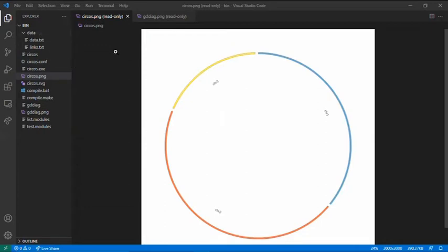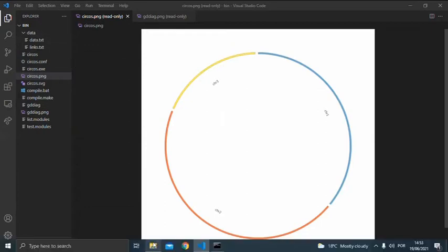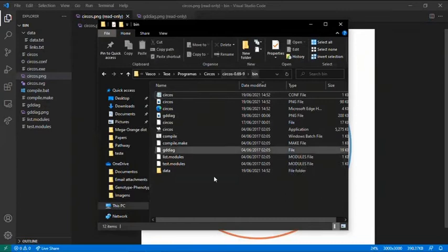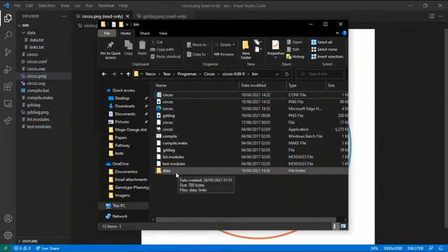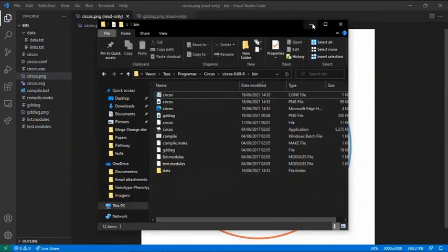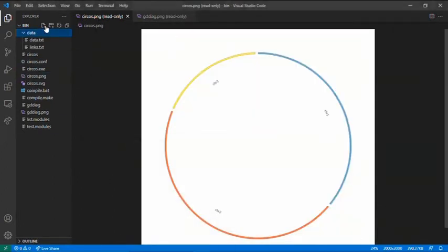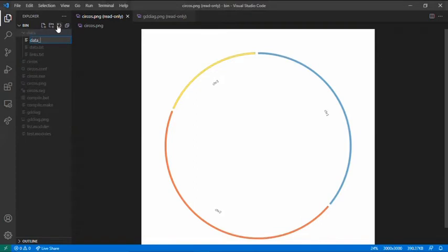The first thing after installation is to, in the bin folder, create a new folder named data. You can call it whatever you want, I will call it data. And within it, create a file named data.test.txt, a text file.